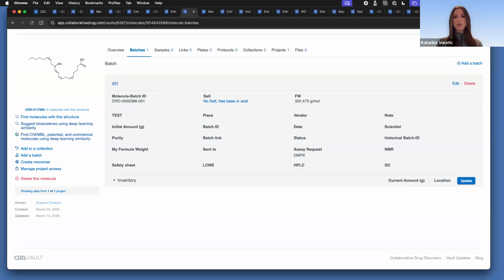What Susana shared, you can use it like Word: type in free text or attach documents, images, tables, calculations as well. And most importantly, it's all interlinked, so everything is a couple of clicks away. You don't have to leave the system. That's what most teams find valuable in these modern tools. Exactly, yes. It's fully customizable.